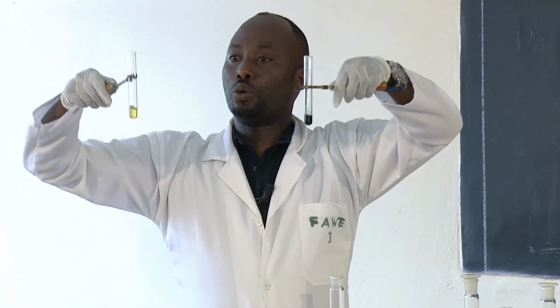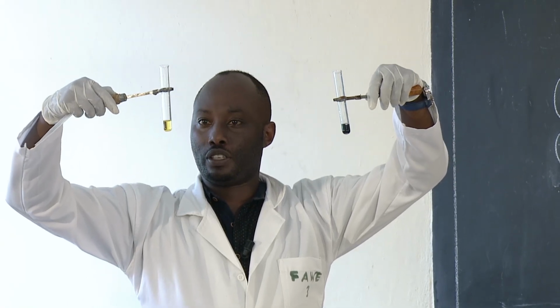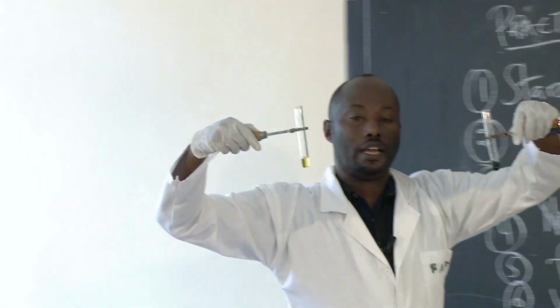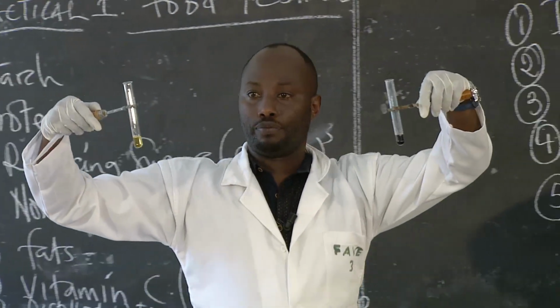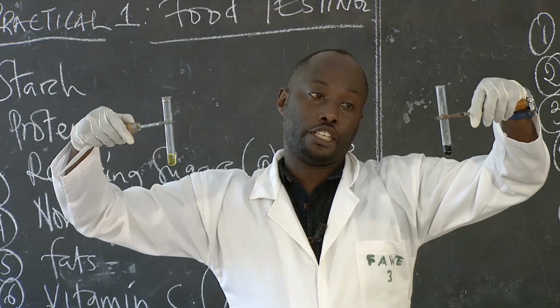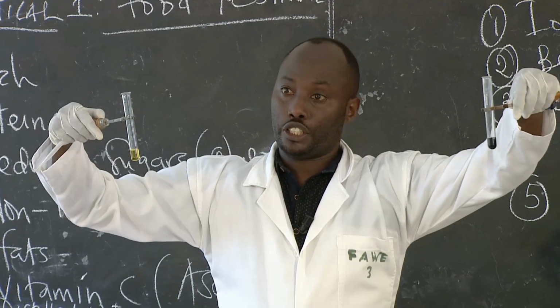You have to observe the two test tubes. As you can see, I have two test tubes, one on the right-hand side and another on the left-hand side. Right, left. In one test tube I put water, and in the other I put starch.